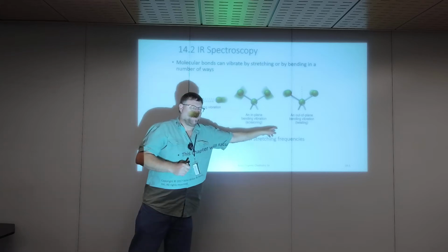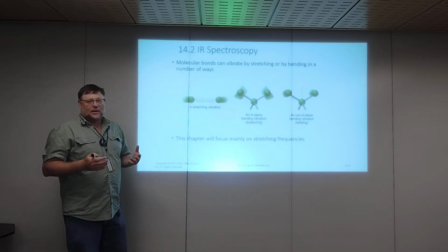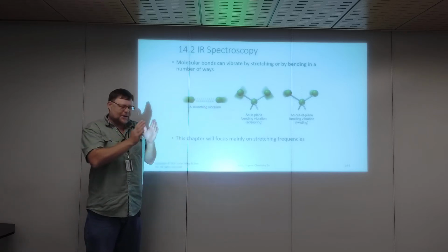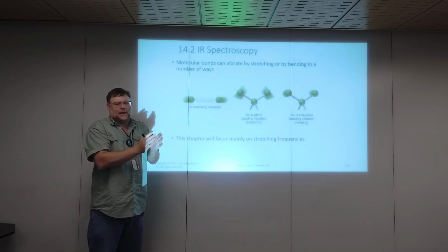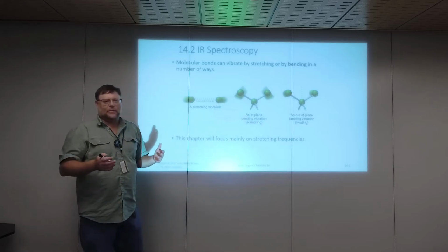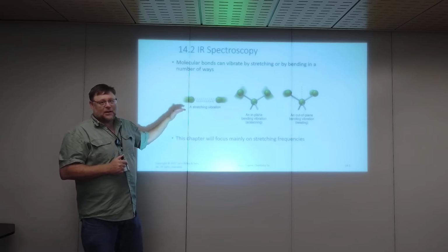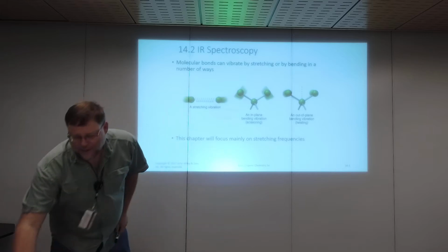We've also got these bending vibrational states. Those are a lot more complex. Depending on what the atoms are, a CH bond pretty much vibrates like a CH bond. It changes a little bit so we can learn something, but they're all in the same basic area of the spectrum. These vibrational states can be wildly different. So we're going to focus on the stretches. And like I said, infrared spectroscopy is going to tell you information about functional groups. How does it do that?